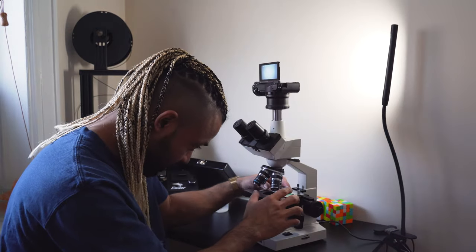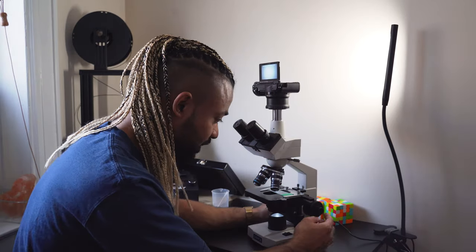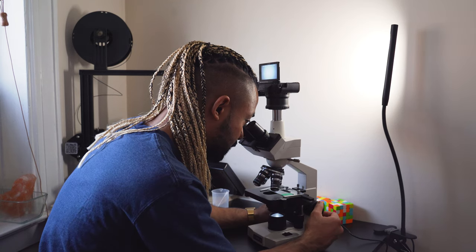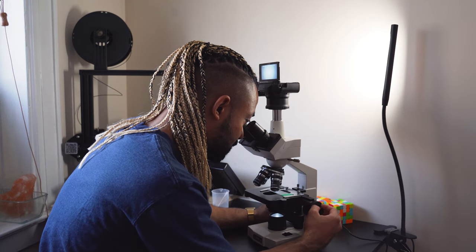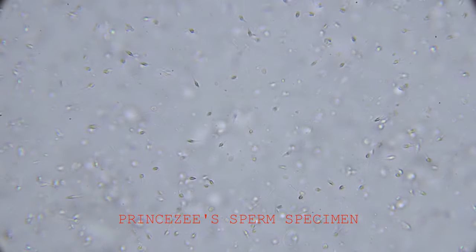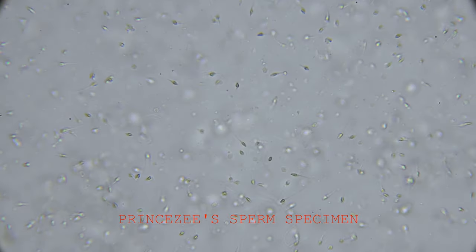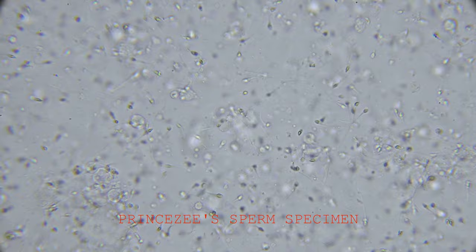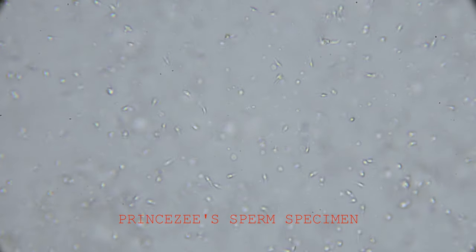I'm down. Okay, guys, so the sperm sample's in, it's locked in tight. We're gonna start off with the lowest magnification and yo, guys, you're gonna love this. Oh my god. Yo, check this out. That's insane. Let's take a closer look at it. Yo, these guys are actually swimming around. What the hell? Yo, they look like freaking tadpoles.